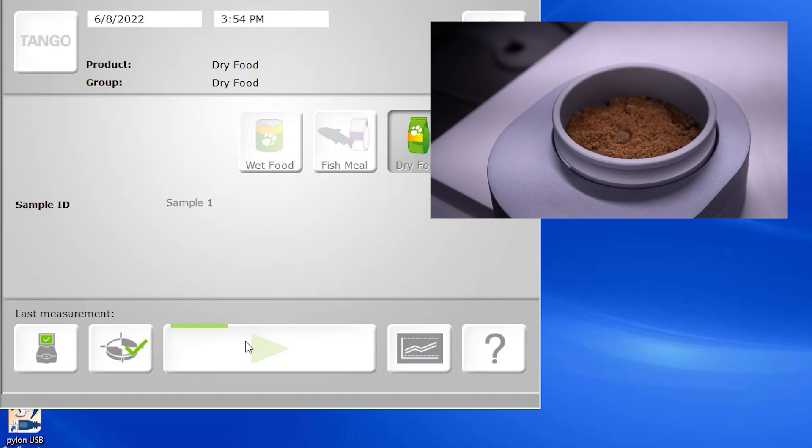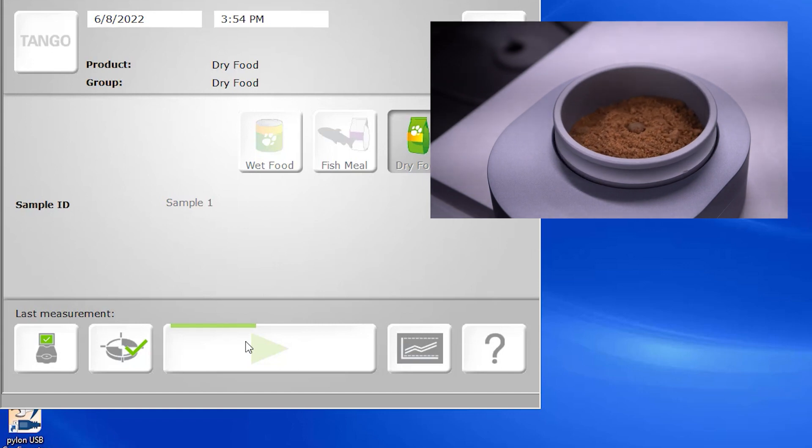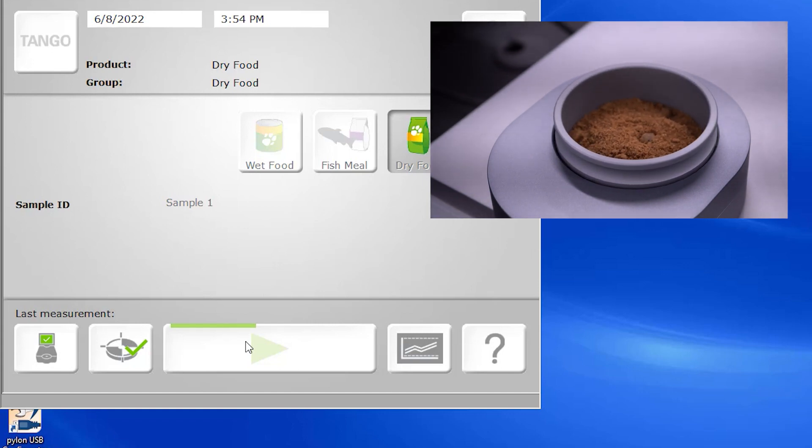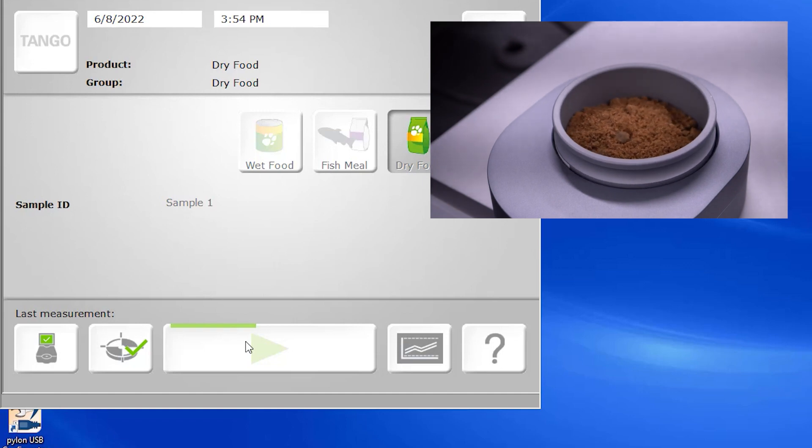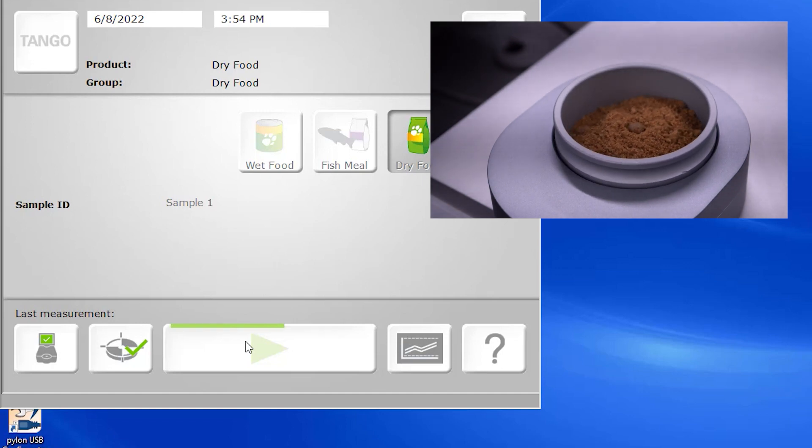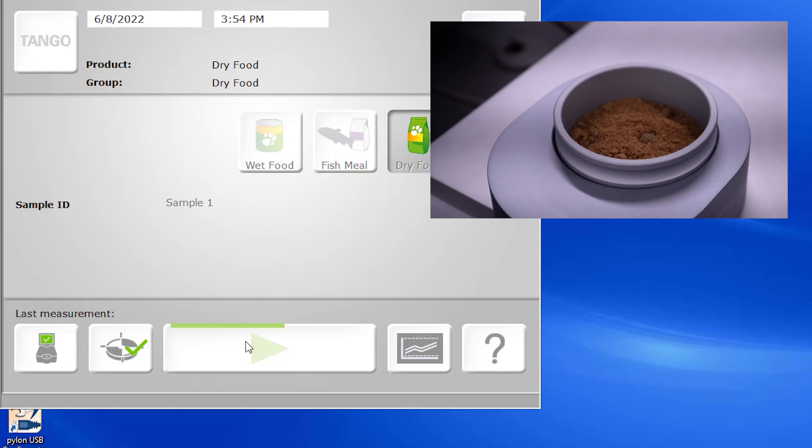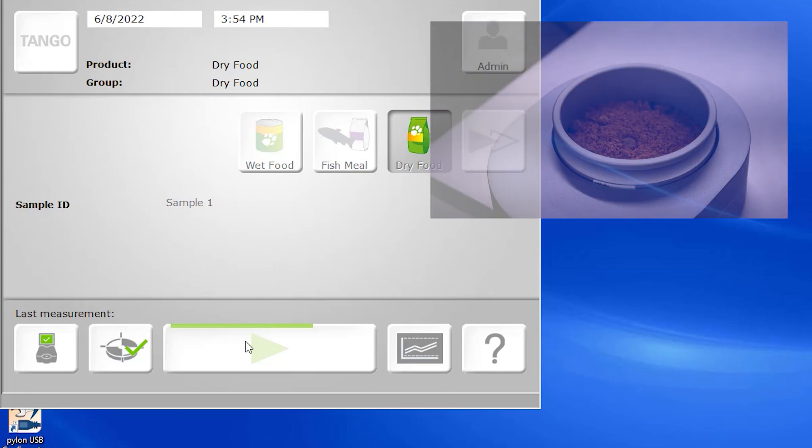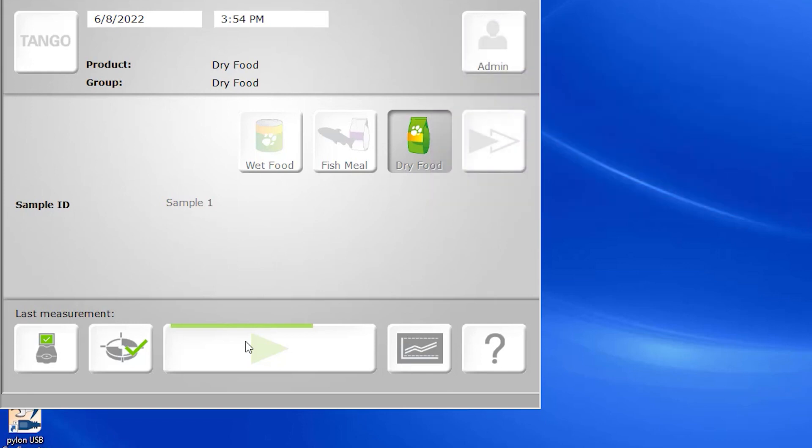Prior to a sample measurement being taken, you can opt for a background measurement to be taken as well. However, with the tango, this feature is also automated. The instrument will automatically close the unit's window, absorbing all the light, and take a snapshot of the environment, the humidity, and the temperature at that particular point in time.